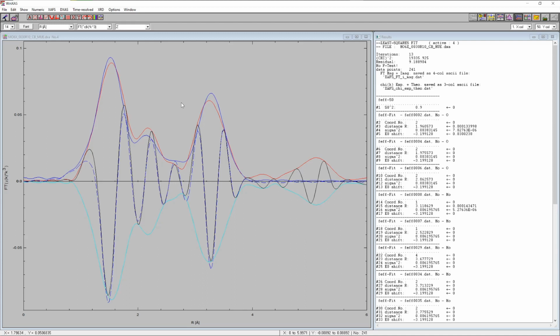So now raises the question, what's with the spectra in between? As you may already have guessed, those of course correspond to mixtures. Yeah, we know from the analysis of the XANES, from the LC XANES fit, that we have mixtures of mostly molybdenum trioxide and molybdenum dioxide. And from the LC XANES refinement, we know the ratio of those mixtures in the individual spectra.